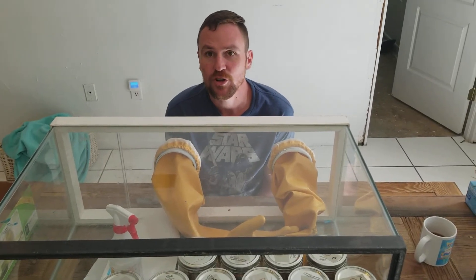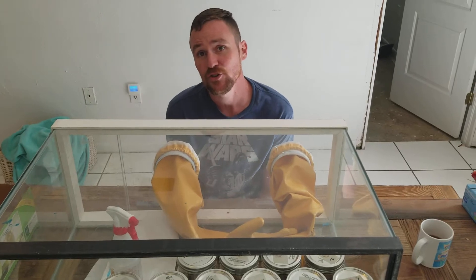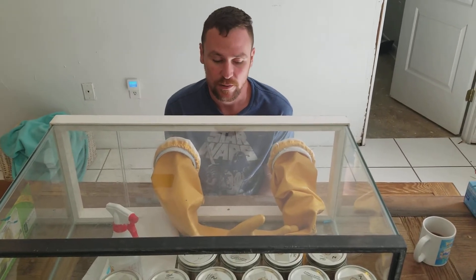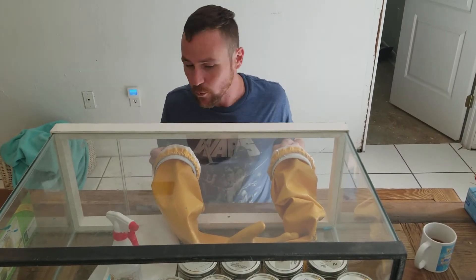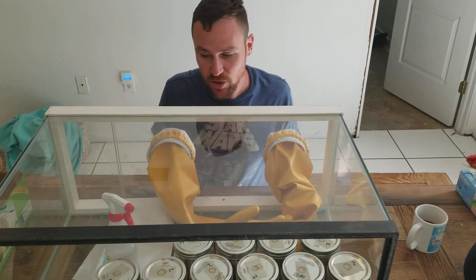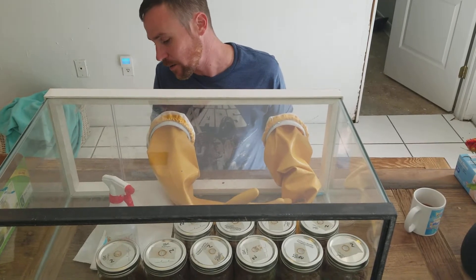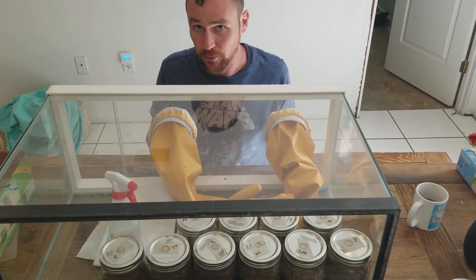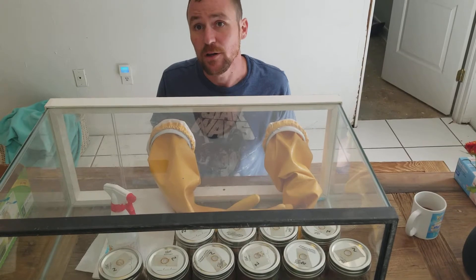We're going to show how to do an inoculated grain culture with a liquid culture inside of a glove box. We use a glove box to keep the conditions sterile. What I did was I put the jars in there and wiped each of them with alcohol, and I cleaned the inside of the glove box and the outside of the syringe and the spray bottle with alcohol. Then I let it all sit for about three to five minutes.